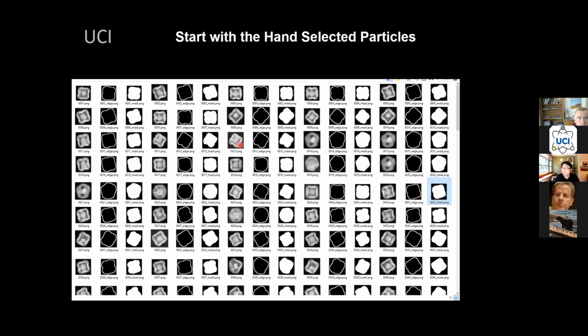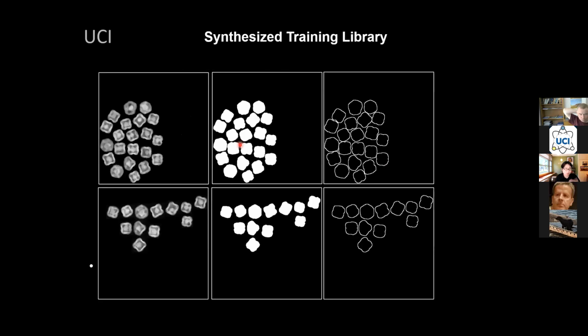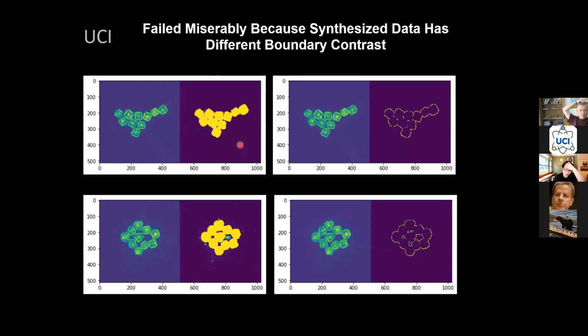So here are a couple of ground truths I first created, right? So you can create a mask. You can create basically, you only segment out where the boundaries are, right? And then you start putting them together into images, and then you train a neural network to find either a segmentation mask or the boundaries.